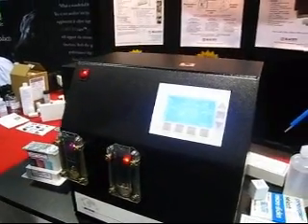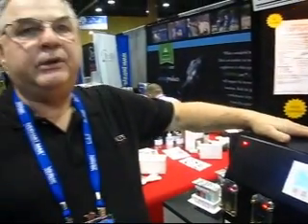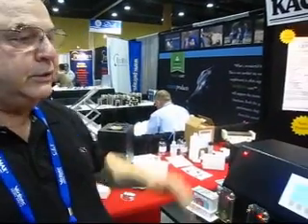The average cost per test is around $0.50 U.S. dollars. Normally, the professional charge here in the U.S.A. is $25, so this is a very high-profit-generating instrument. Your technician no longer has to dip the slides and spend the time — they can be in the clinic with the doctor, helping out with the dogs, or administering other needed services.